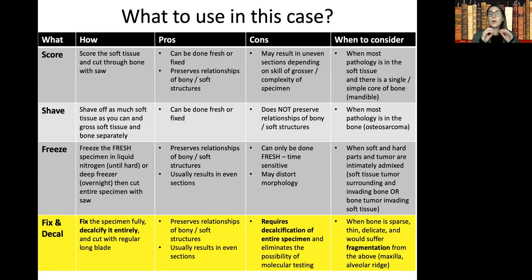But again, if you are in need of molecular testing, you may not want to do this in an HCl decalcifier because you will no longer be able to do molecular testing. We'll talk about molecular later. Don't worry. Just keep this always in the back of your mind. So again, we're going to use this when the bone is sparse or thin or delicate and would suffer fragmentation otherwise.